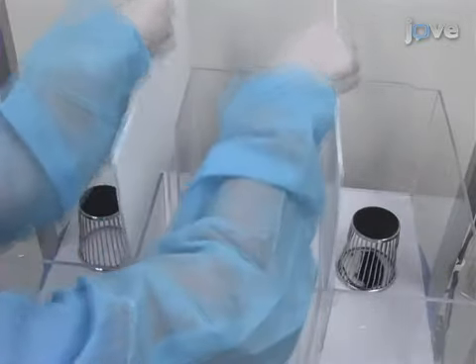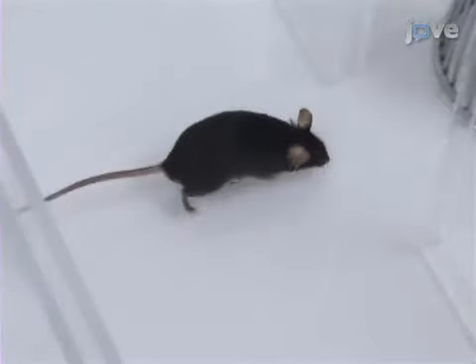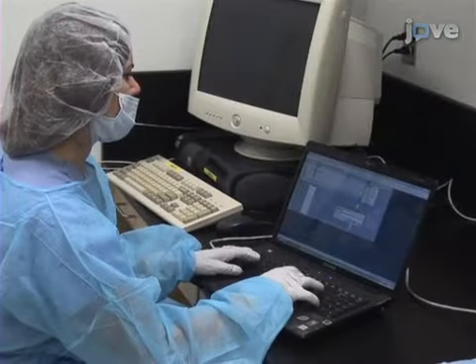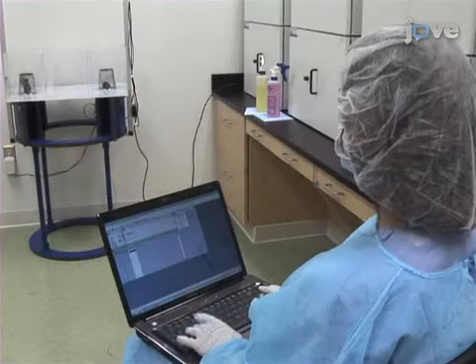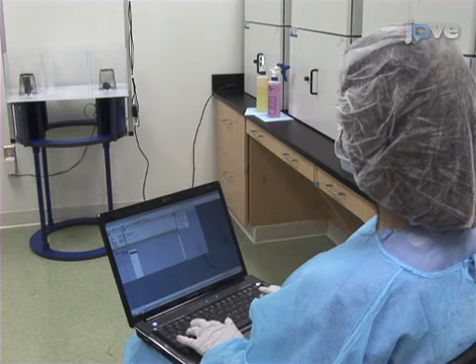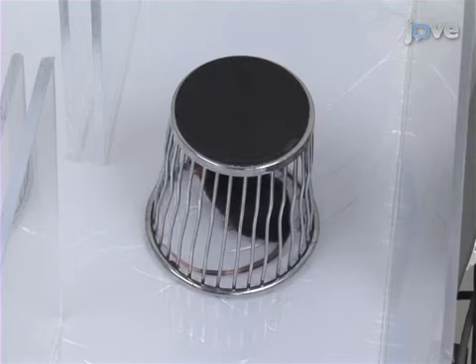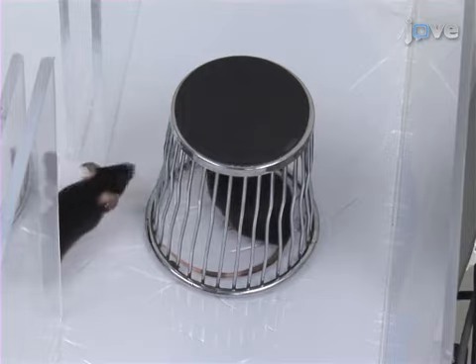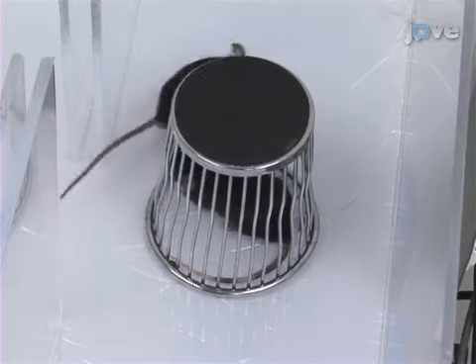After the habituation period, remove the walls between the compartments to allow the subject to freely explore all 3 chambers. Immediately begin to monitor and record behavior for 10 minutes. In this example, the Observer program is used to monitor behaviors in real time using codes for the parameters of interest. Record the duration and number of direct or active contacts between the subject mouse and either the empty cup or the cup housing the Stranger 1 mouse.